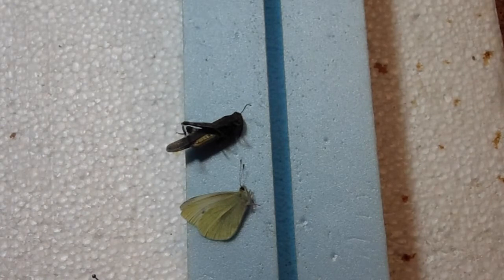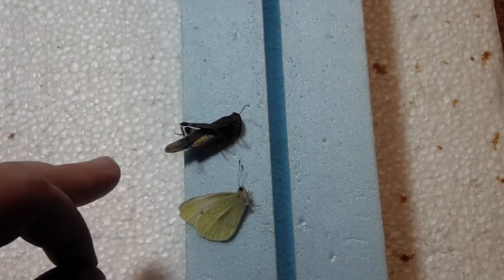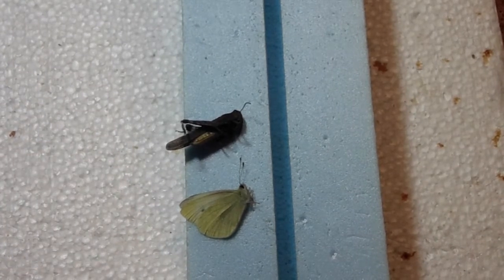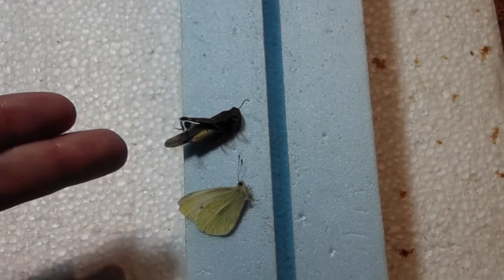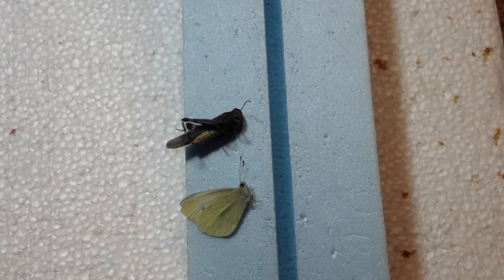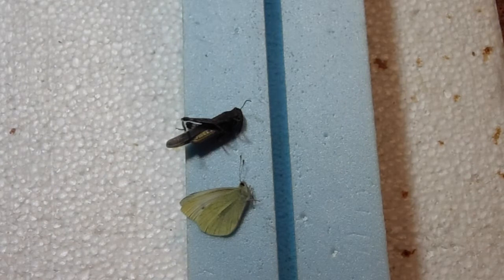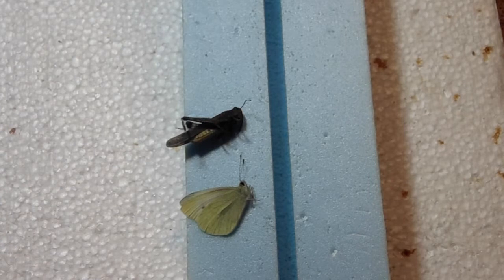Welcome to part two. These are the two specimens I'm going to be showing you in this part. I got a butterfly and a grasshopper that I'm going to spread as well. The grasshoppers that you usually tend to spread are the band-winged grasshoppers, which have colors and patterns on the hind wing that help aid in identification. But to start off, I'm going to do the butterfly first.